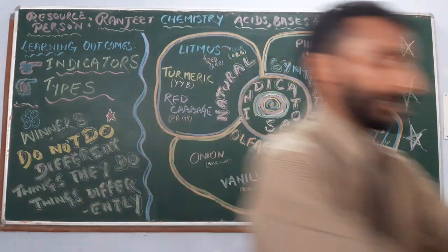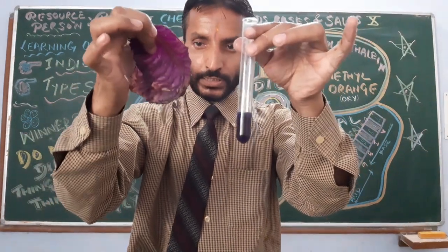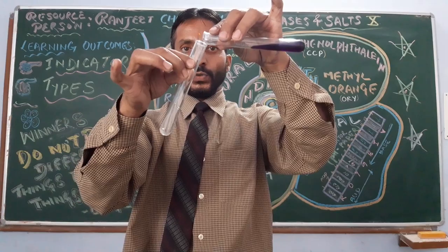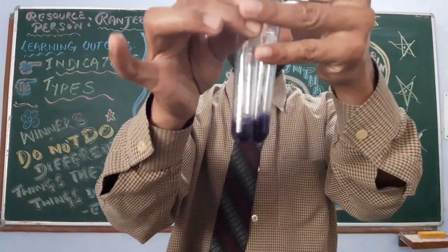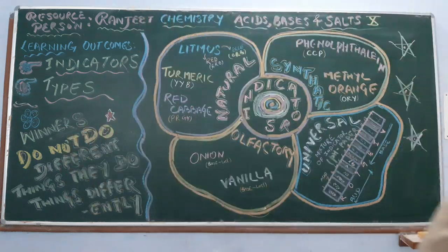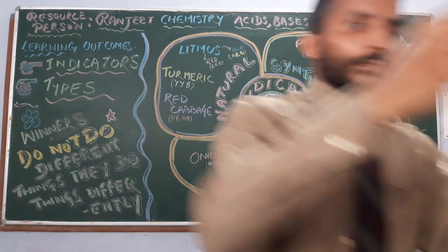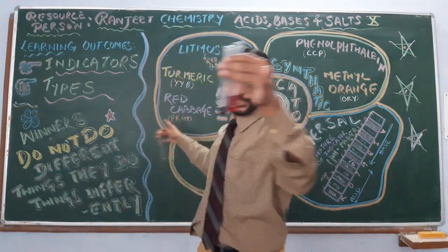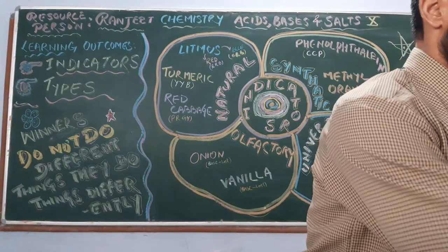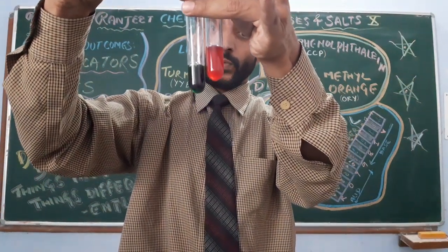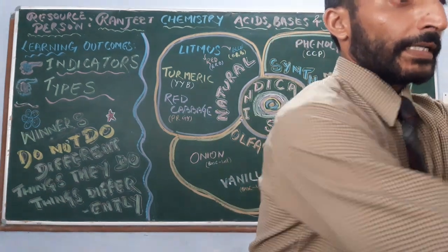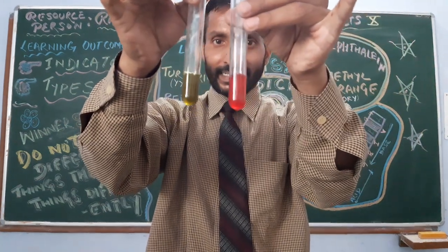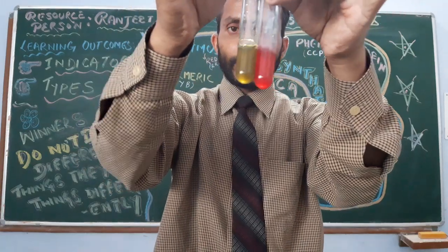I have extracted juice from the red cabbage — this is purple colour. I will divide it into two parts. I will use first in acid, then base. In acid it is reddish — it becomes red. When I add base, it becomes greenish yellow. So: acid — red; base — greenish yellow. This is from the cabbage.